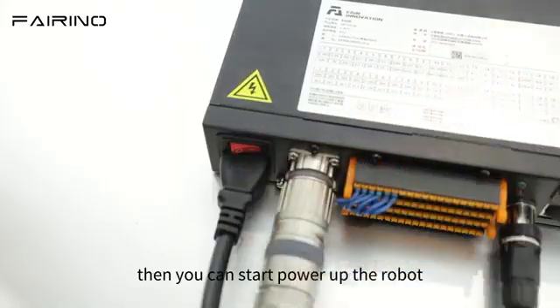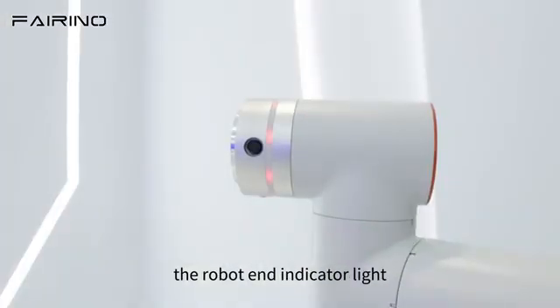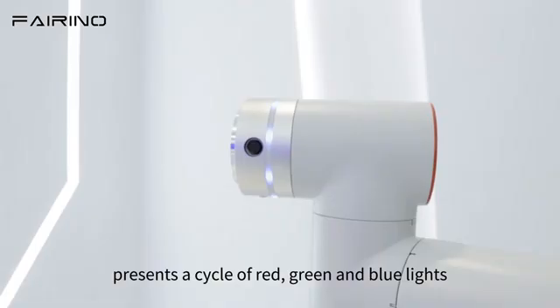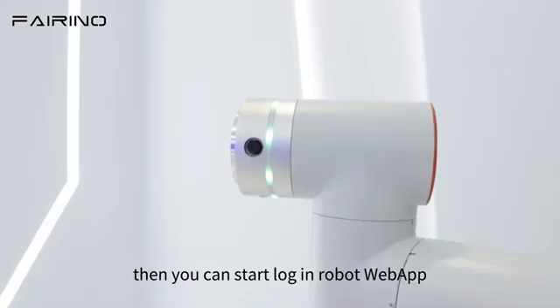Then you can start to power up the robot. During the robot power-up process, the robot end indicator light presents a cycle of red, green, and blue lights. Wait for the indicator light to turn green and stay always on, then you can start to log in to the robot web app.